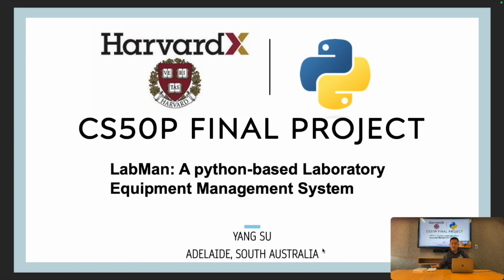For years, we have been using this paper notepad to track equipment borrow history. However, this is very difficult to use. Sometimes students forget to write down key information such as the student number and the stuff they borrow from the lab. Or the handwriting is scribbled. I want to introduce my revolutionary solution, LabMan.